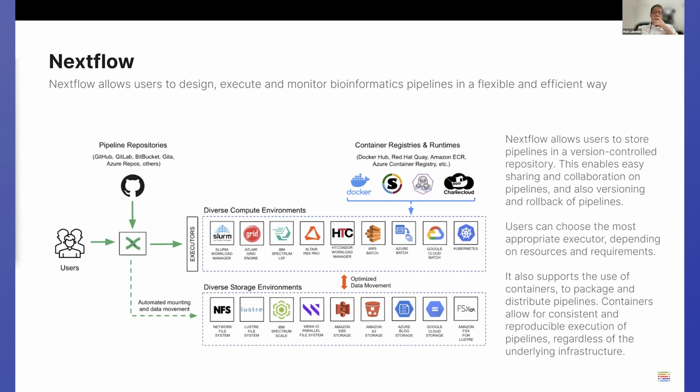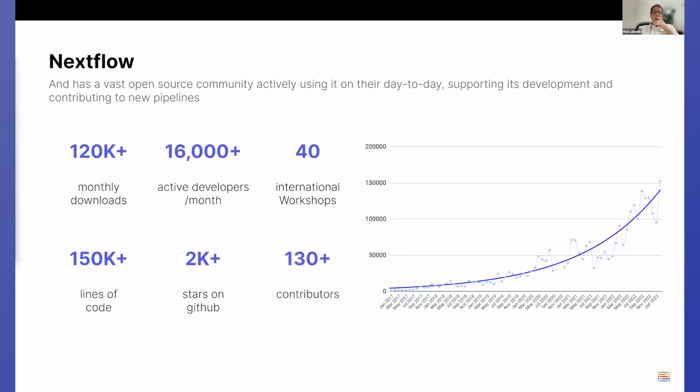Next slide. I'm going to show you the growth of Nextflow on the next slide. So Nextflow itself has been growing very rapidly. The growth is strongly driven by the community, particularly the NF Core community. We're seeing all kinds of activity around NF Core, and that in turn is driving the Nextflow community. Obviously, we at Seqera have a strong interest in supporting, investing in and encouraging this effort, both the Nextflow effort and the NF Core effort.